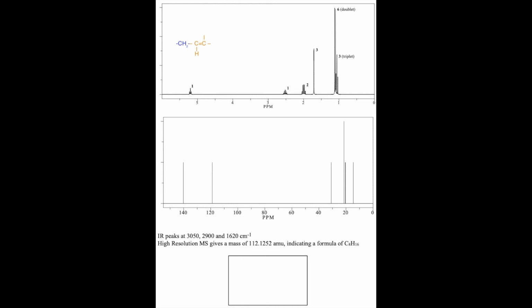All right, so I'm out of peaks that are interesting with respect to chemical shift. So that means that I'm going to look for peaks that integrate for 3 or multiples of 3, and I've got quite a lot. In this case, let's go to the far right. I have a CH3 triplet, and I say that it's a triplet because it's kind of mushing up against that other peak. So just to make sure it's clear that it's a triplet, I have it drawn out that way. Okay, there is a CH3.